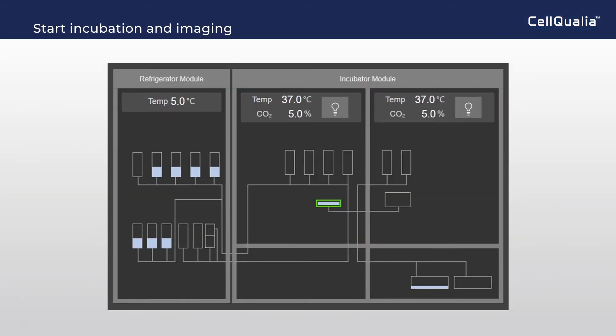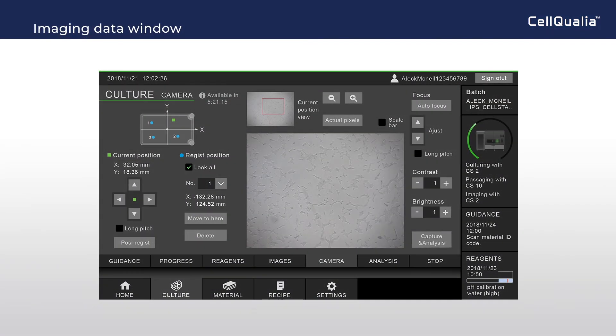Incubation starts, and a CMOS camera takes real-time images. In the imaging data window, the cell image and imaging position can be monitored at preferred timing.